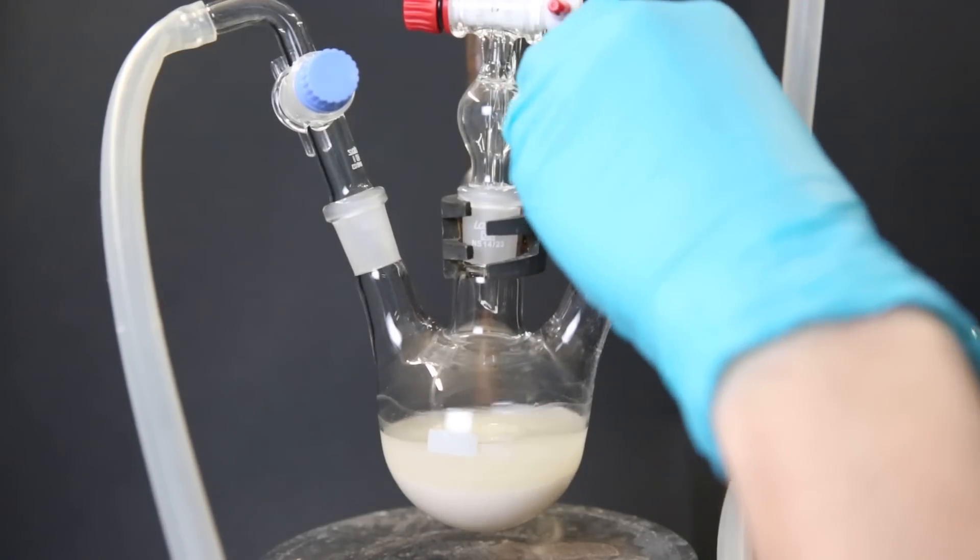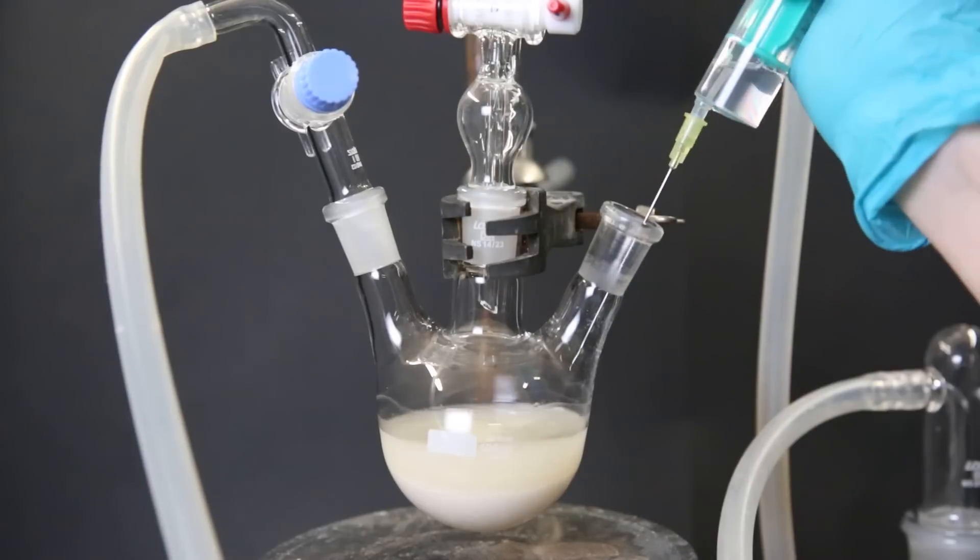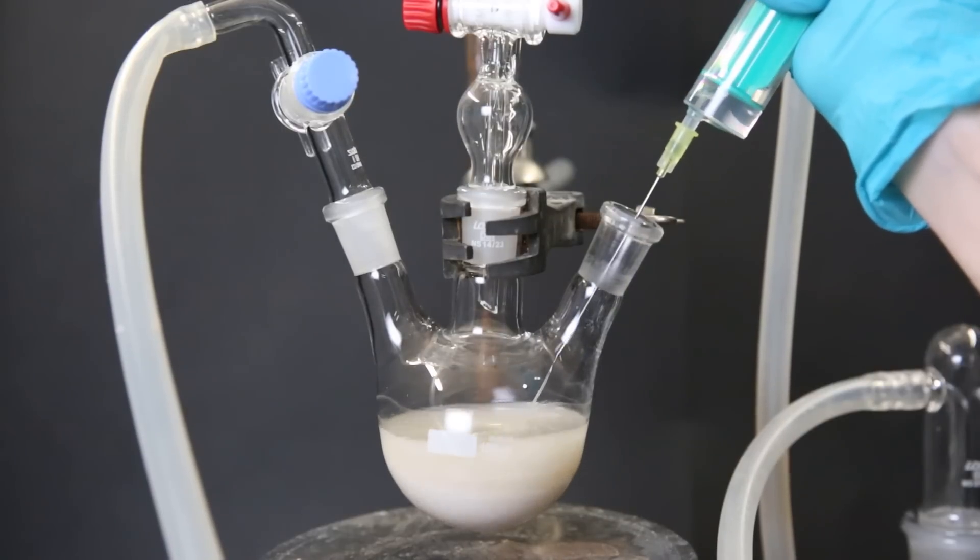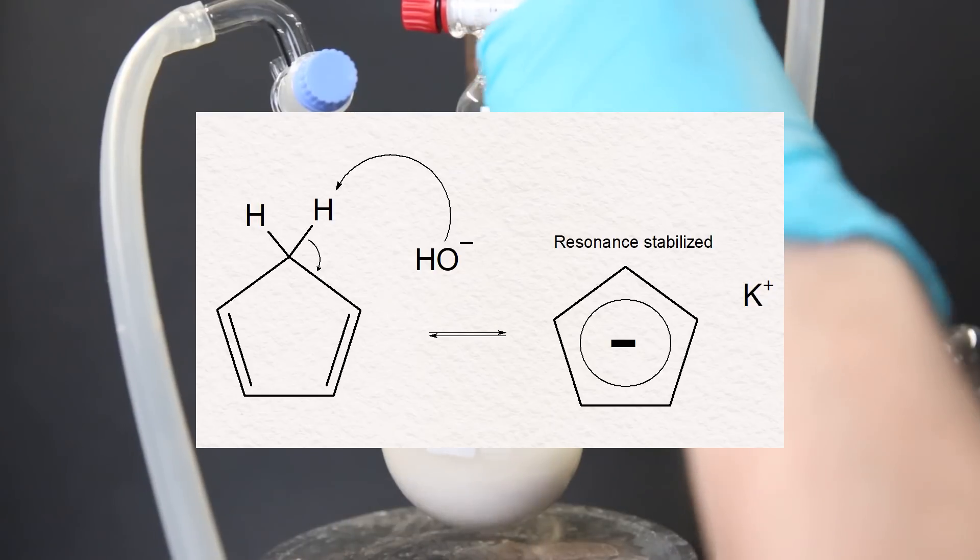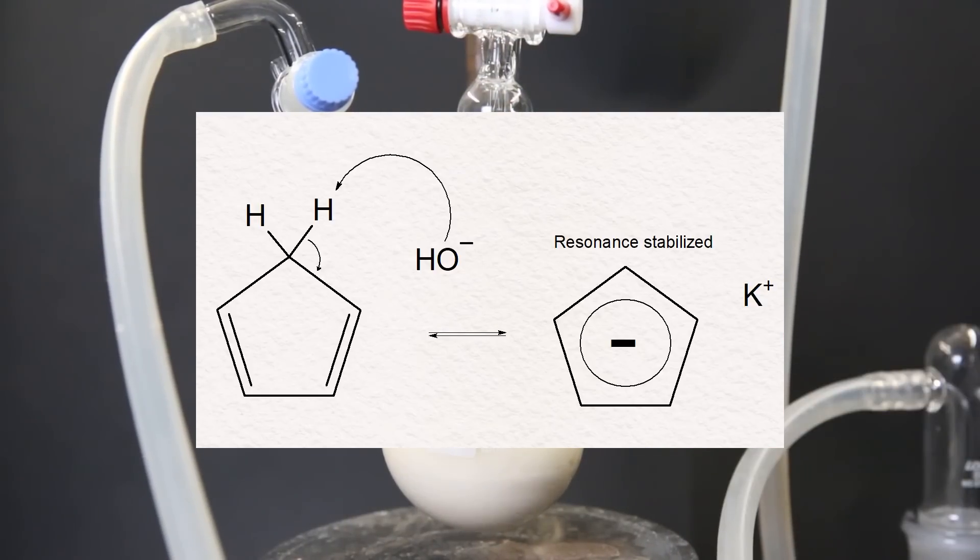Now under continuous argon flow, I add in approximately 4.25 mls of freshly cracked cyclopentadiene. In this reaction, the KOH will deprotonate the cyclopentadiene and form the cyclopentadienide ion, which we can use to make ferrocene.